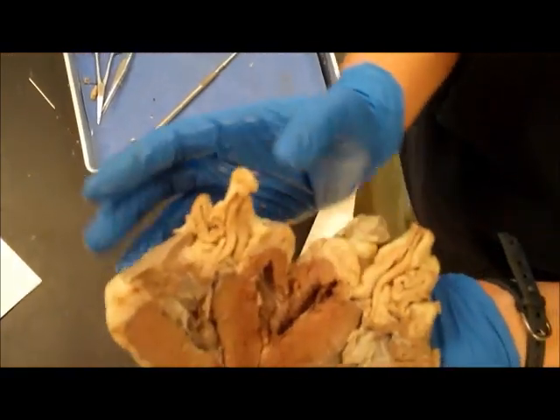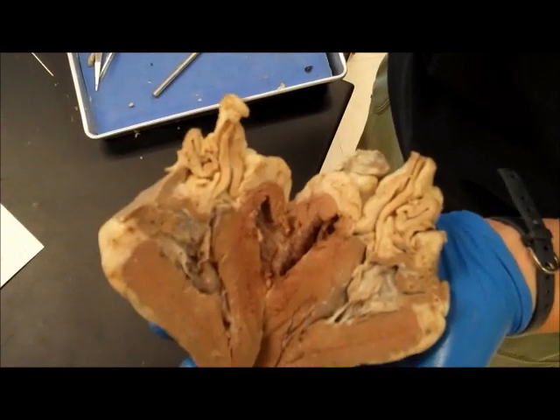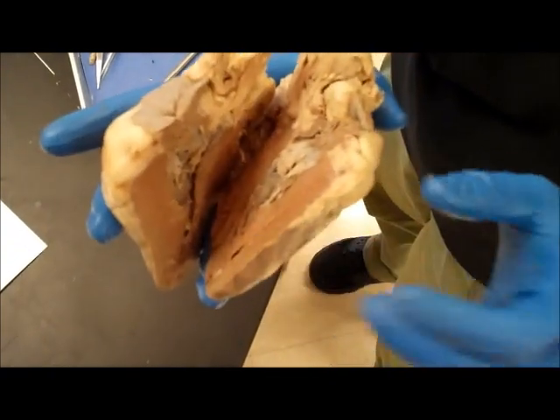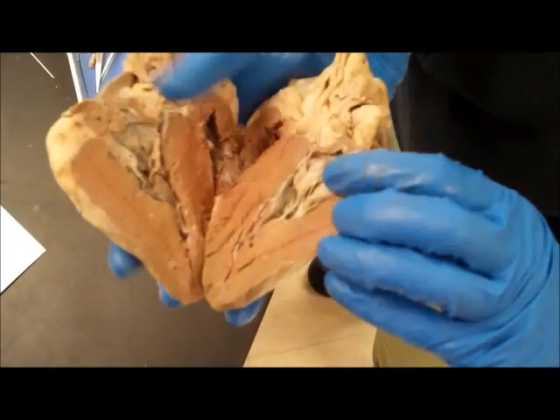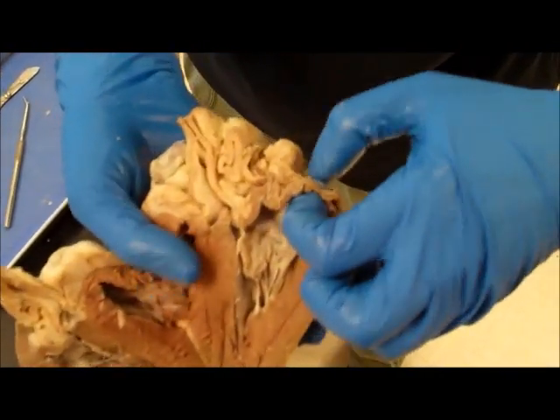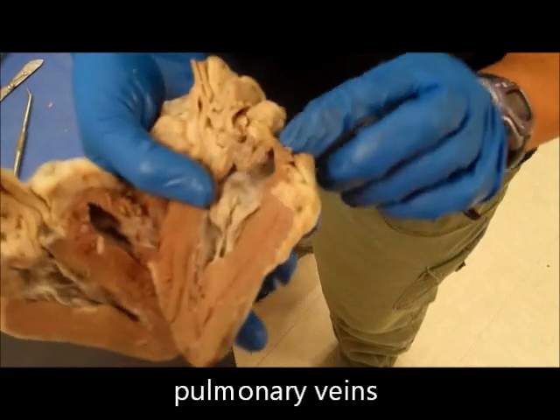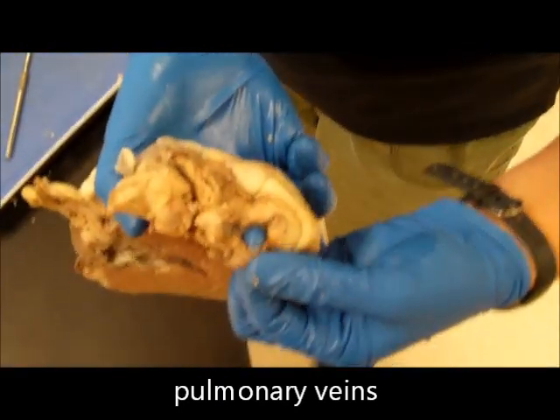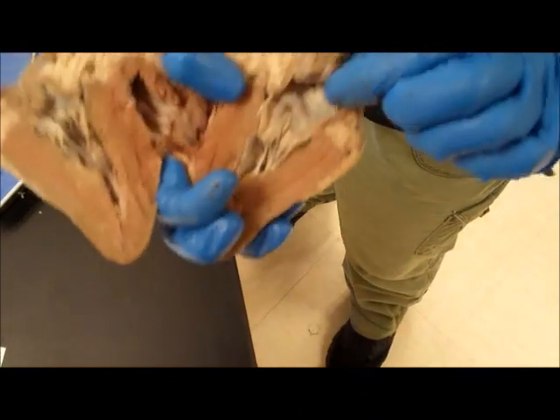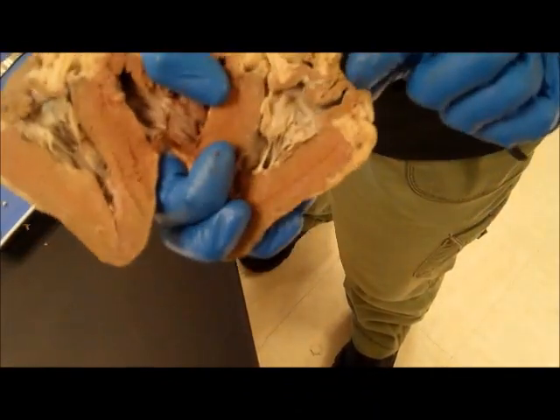So our blood is going to go to our lungs, it's going to pick up oxygen, it's going to drop off CO2, and then it is going to come back to the left side of the heart, and it is going to enter the left atrium via the pulmonary veins. Okay, and we have our pulmonary vein, and again, because of the way that this heart was dissected out, we've just got a little bit of remnant there of the vein.